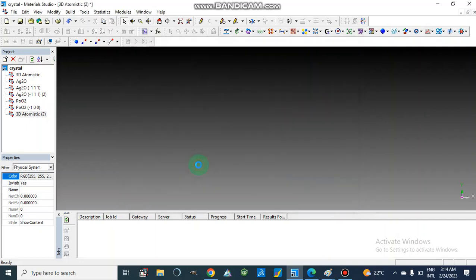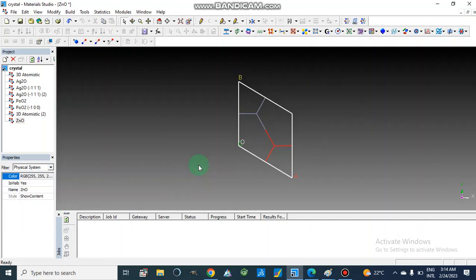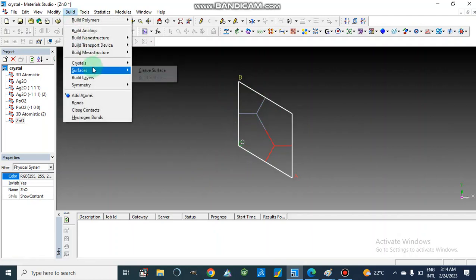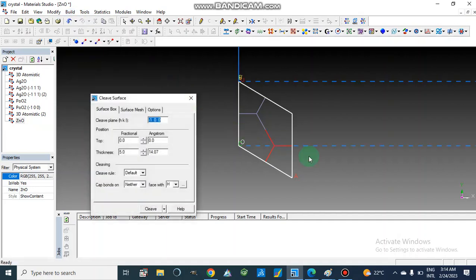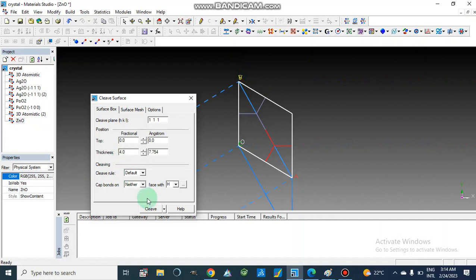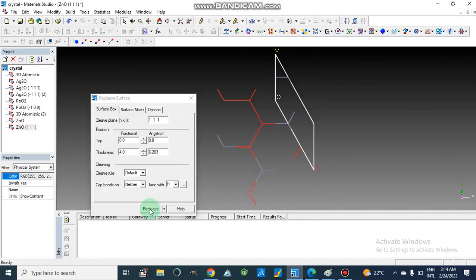I am going to plot zinc oxide — let's suppose we are making the crystal structure of zinc oxide. After opening this, we will go to Build, then go to Surface and Cleave Surface. Now we will make this surface. Here we have an option for the cleavage plane — I am going to set this as (1,1,1) for the cleavage plane, and the thickness is 5.